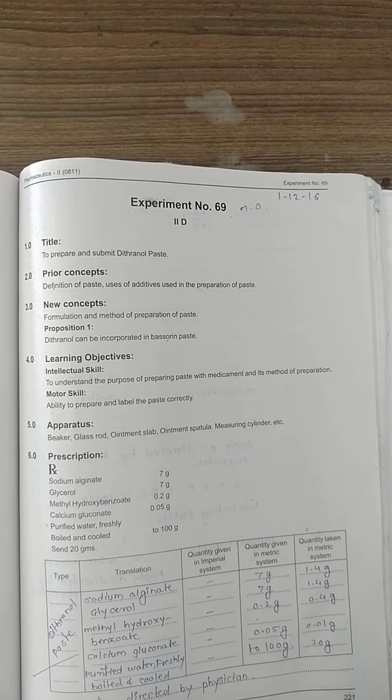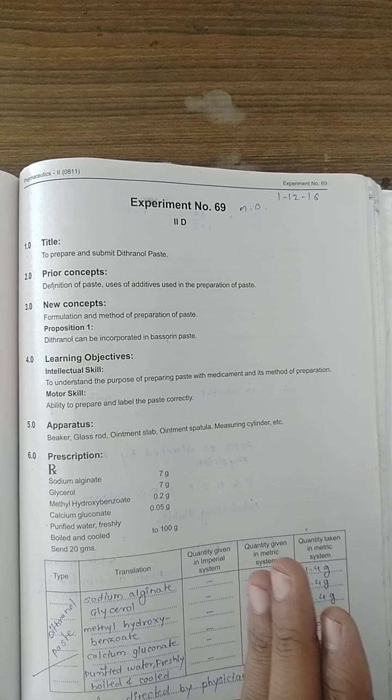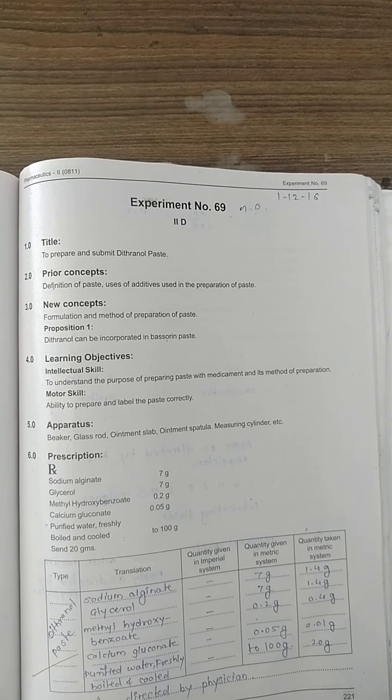In experiment number 69, there is a correction in the manual — experiment number 68 listed in the manual corresponds to experiment number 69 by mistake, a printing error. As per the correct code, we will prepare a jelly. Jelly means a transparent and translucent, non-greasy semi-solid preparation.